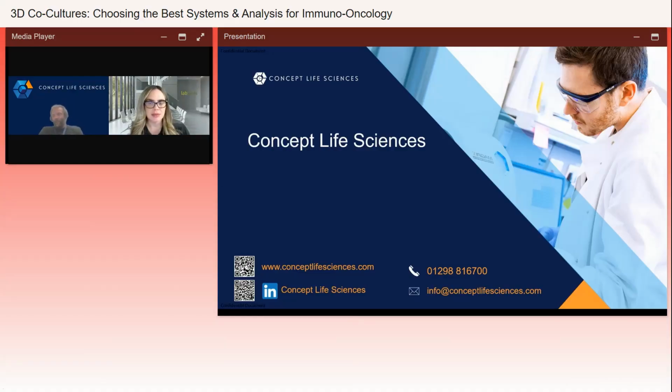Yeah, so this is something we're just about to start embarking on ourselves. I think part of it is choosing what stage those cells need to be incorporated into these models. So I think that's going to be very tissue dependent. Obviously, the first one we're going after at the moment is liver. But like I say, we're just about to start going, so we're thinking we might need to go just before they're going through their final differentiation, so start incorporating them at that point, and then start incorporating the other cells alongside it as well. That's going to be a lot more difficult, I think, and there's a few questions we need to answer there ourselves as well.